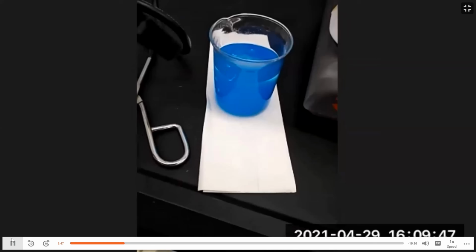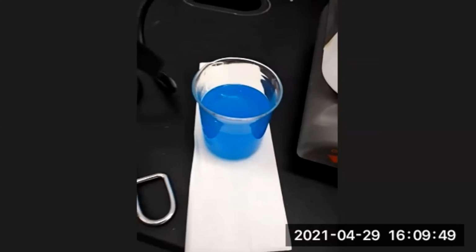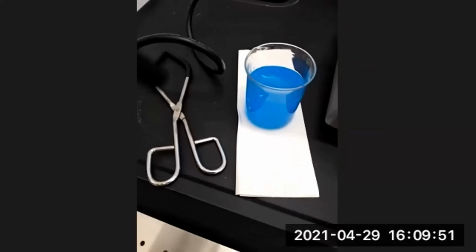So again, see the blue precipitate in the beaker. That dark blue precipitate is copper 2 hydroxide. You may want to stir it a little to make sure the reaction goes to completion.